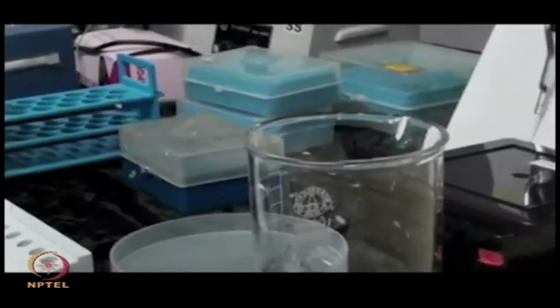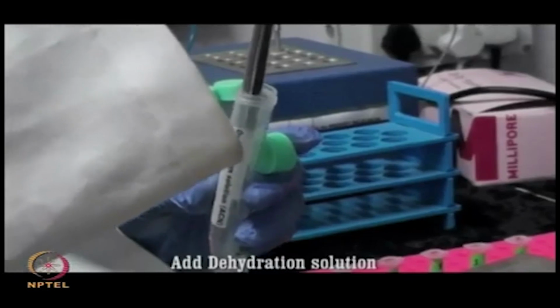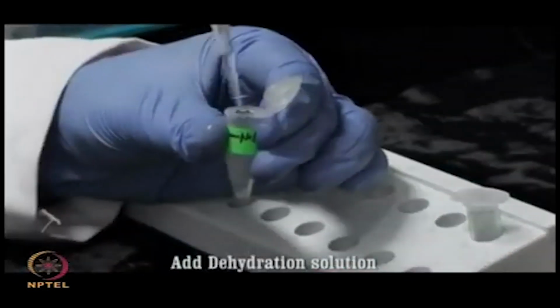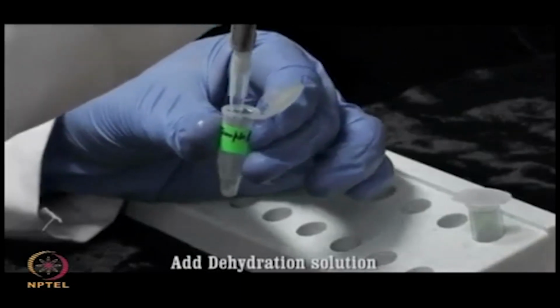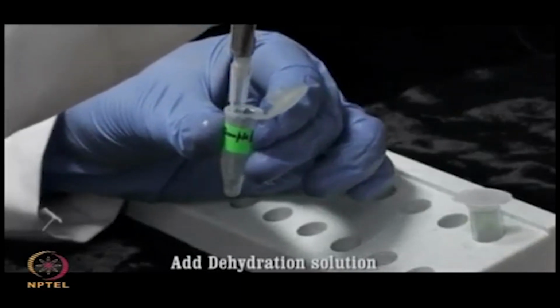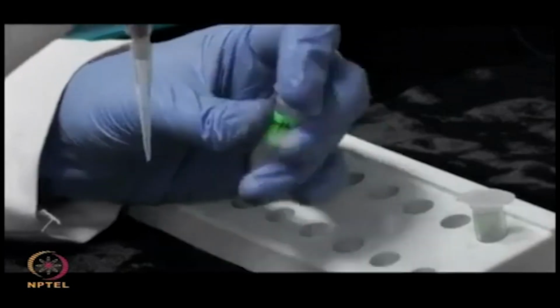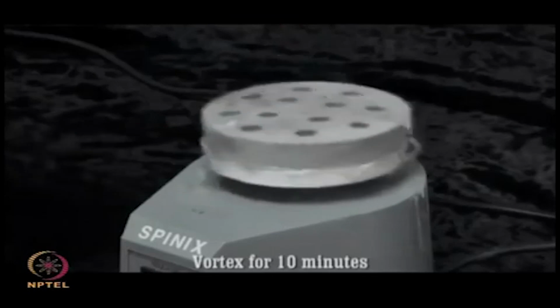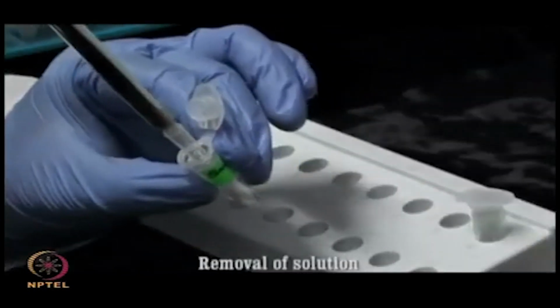Now, chill down the tubes to room temperature, add 50 microliter of dehydration solution, mix it properly and incubate for 10 minutes. Now, remove all the liquids.